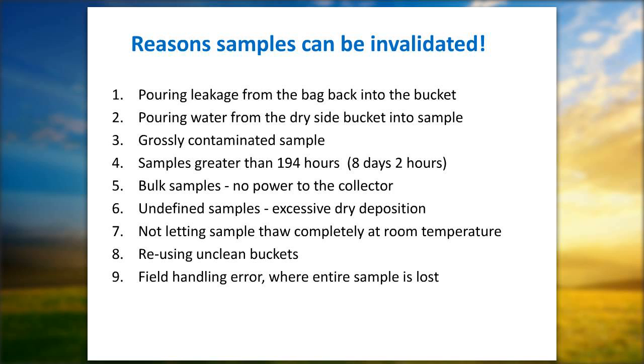Also on number 4, if we could go back to number 4, a lot of the operators will ask, specifically a couple of years ago when Christmas occurred on a Tuesday, what we want you to get is a sample that's under 194 hours. So if you have to go Monday to Monday or Wednesday to Wednesday, as long as you can get back on that Tuesday to Tuesday cycle at some point, then it's okay to go ahead and change your sample on a different day, as long as it's convenient for you and under the 194 hours.